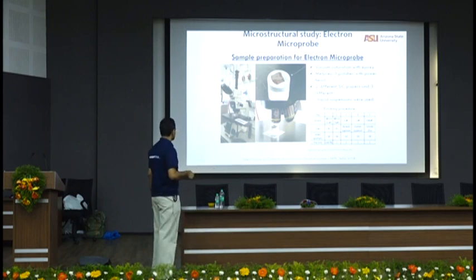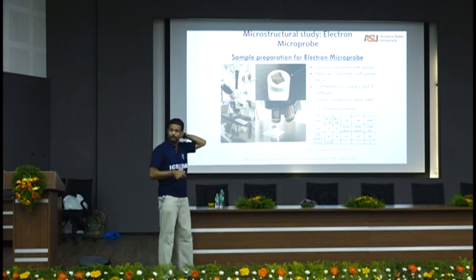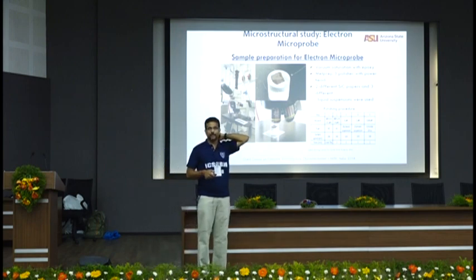So you look at the polish with a microscope to make sure that it's really nice, with a lot of grits. Again, I just put this because somebody was asking about sample preparation yesterday. So again, some idea about how to prepare samples. Coarser to finer grade: 15 micron silicon carbide, 8 micron silicon carbide, 3 micron diamond suspension, 1 micron diamond suspension, 0.04 micron colloidal silica. By the time you've polished this, you can do your makeup on the sample.